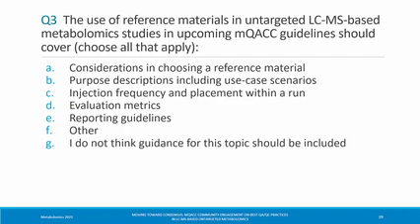So I'm actually a younger investigator, but I really wanted to make a case for B in the use case scenarios. Because when we are evaluating what kinds of QC samples we want to include in our runs, it gets very confusing as you start thinking, do we want to capture technical variation, biological variation, all of the different kinds of considerations for our QCs.